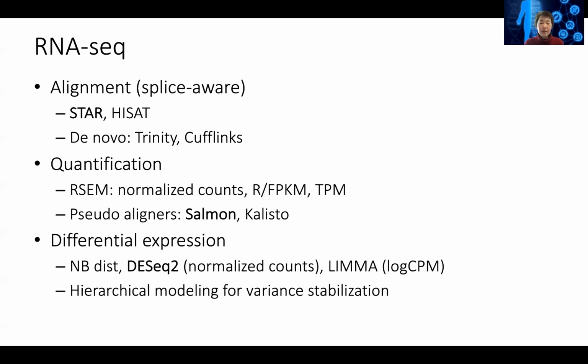Besides, these algorithms can run either directly on the FASTQ file, or if you already have the alignment, you can also run Salmon and Kallisto on the BAM files from a STAR alignment.